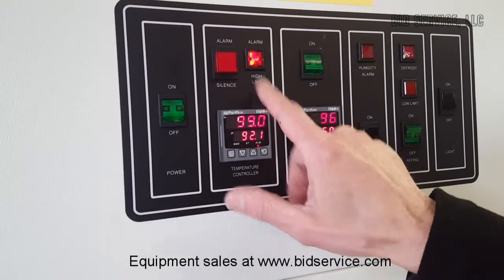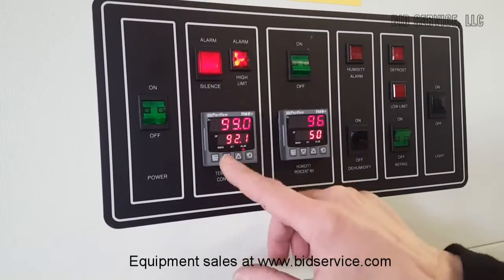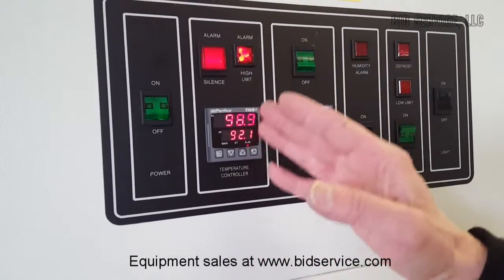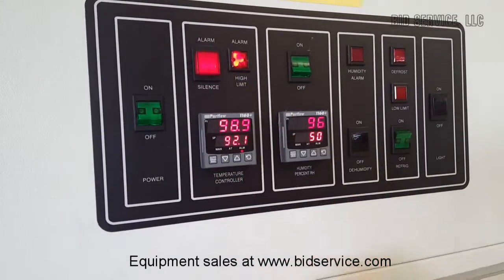That's our high limit alarm — it can be silenced by hitting this button. The reason it triggered is I think it's only a couple of degrees above the set point. I think it needs to be set at one degree above it, so if the temperature is one degree above that point you'll get the alarm. Again, you can always just hit silence.